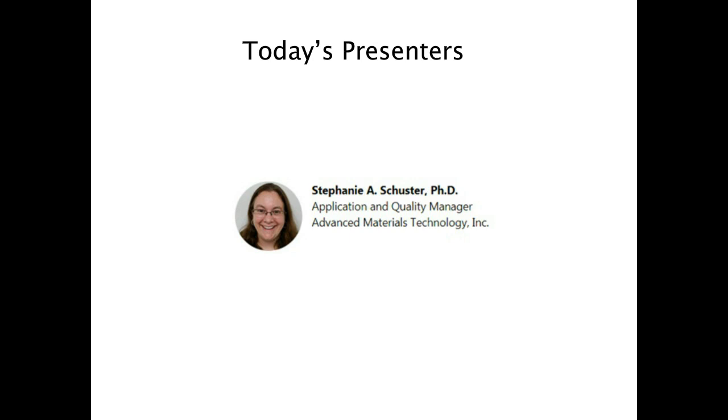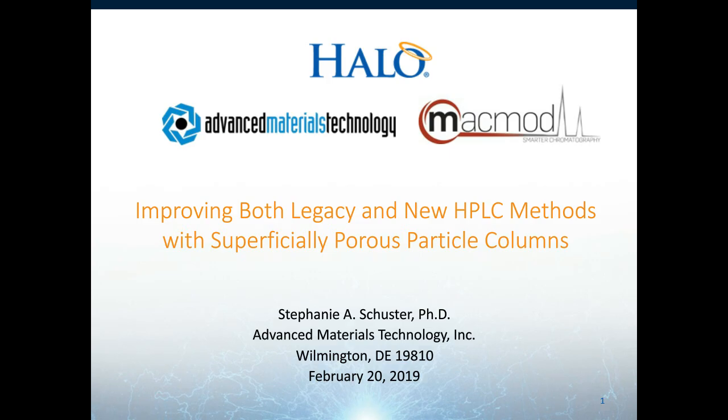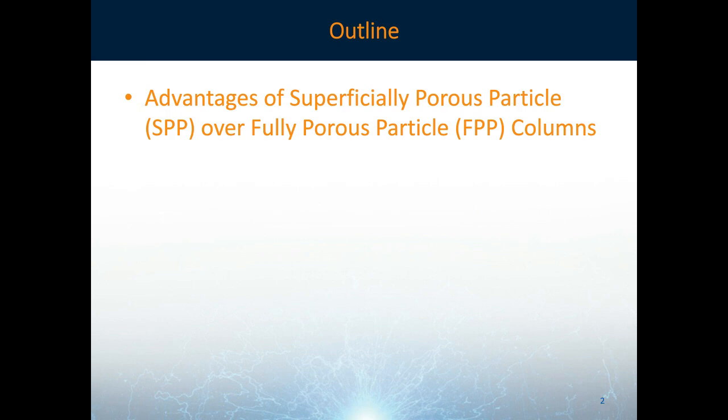Please get us started. Thank you, Laura, for the introduction, and thanks to all who are joining us today. So I'll be talking about improving both legacy and new HPLC methods with superficially porous particle columns. Here's a brief outline of my talk today. I'll go over the advantages of superficially porous particle, or SPP, columns over fully porous particle, or FPP, columns.